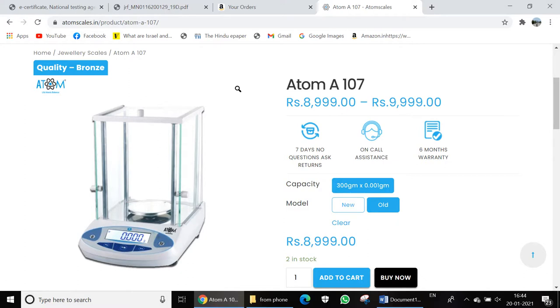In this video, I'll be unboxing an electronic multipurpose weighing scale that I recently bought online from a website called AdamScales.in. The website sells it as a jewelry scale with model name Adam A107. The weighing balance has a load range between 300 grams and 0.001 grams and was sold for Indian rupees 8,999.